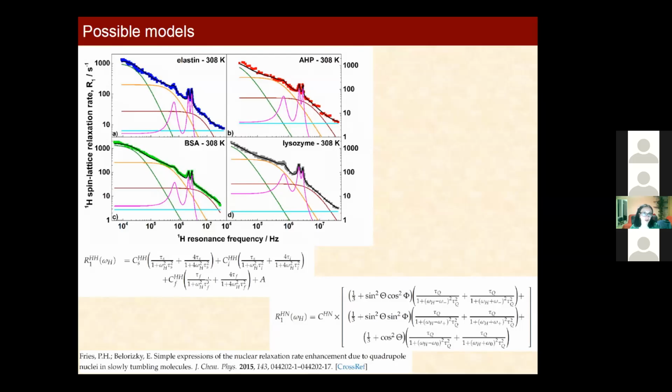It's not really original, and one can say in principle, but you see, if you had decomposed them into 5, you would get even better. Okay, I'm saying I got a very nice one. However, of course, it does not make much sense, and it's hard to say when to stop. I mean, okay, I might trust in such a decomposition if it included 2 processes plus a constant. Well, in this case, we needed 3.